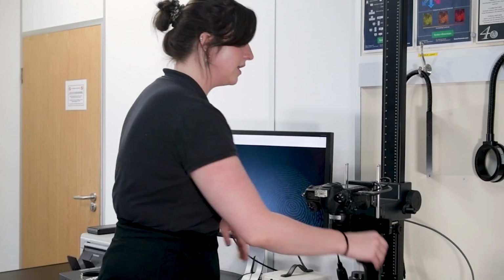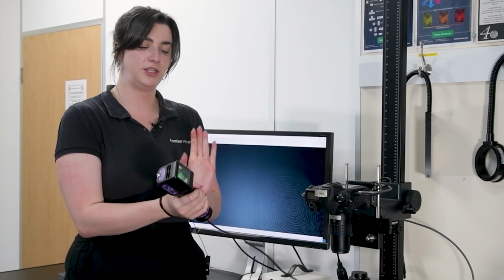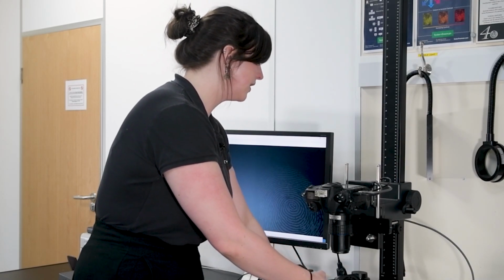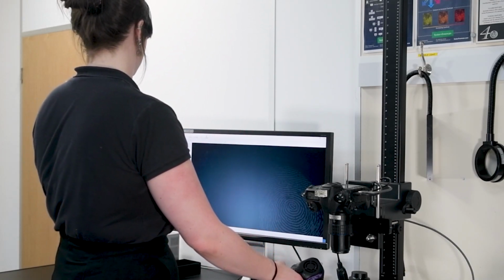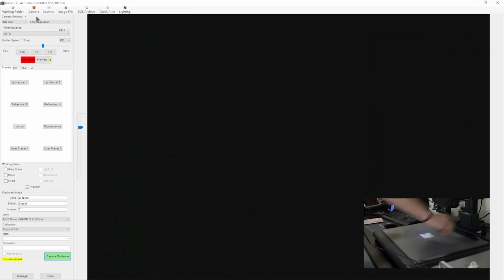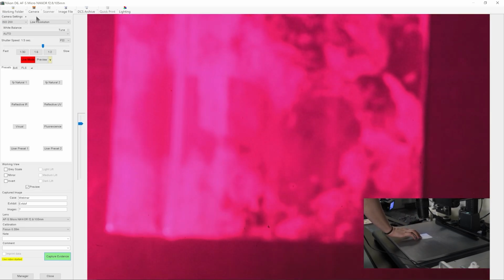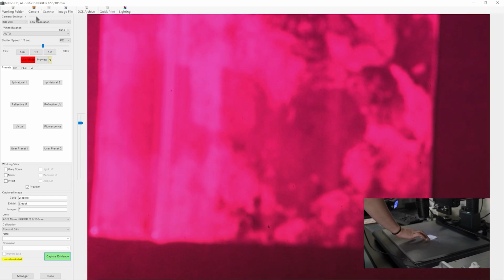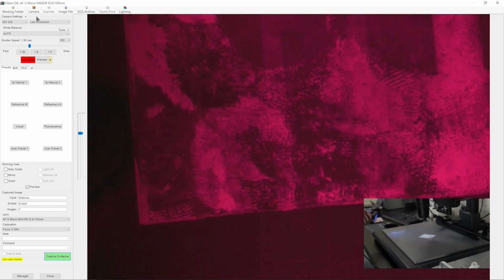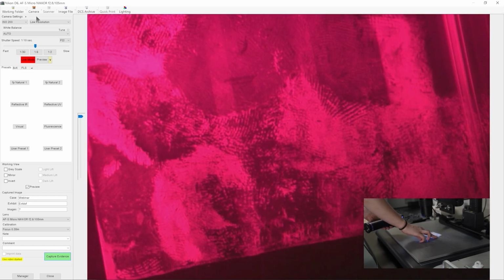So the final thing I need for this, and I need to make sure I have, is an 82S UV. I'm going to use this as my light source, and I'm going to move it around and angle it so that I can view the fingerprints on the live feed of the DCS. What we will see on the screen will actually look quite different to what we will see on the physical sample. So, visibly, we do not see the same result as what we are seeing reflected in the live feed from the camera.